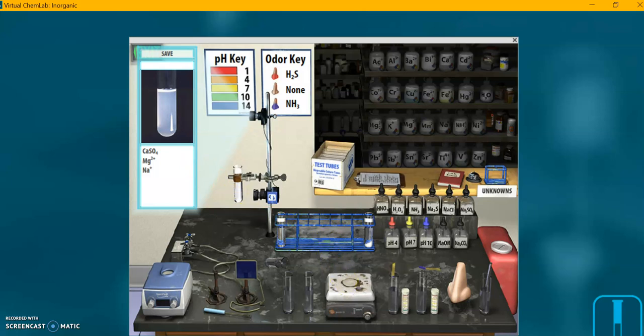I could take that hot plate away. Now, you know, in real life, of course, it wouldn't heat it instantly like that. We would have to actually put this in a beaker of water and put that on the hot plate for a while or hold this over a Bunsen burner to actually get that precipitate. But in the virtual lab here, things work much more quickly.